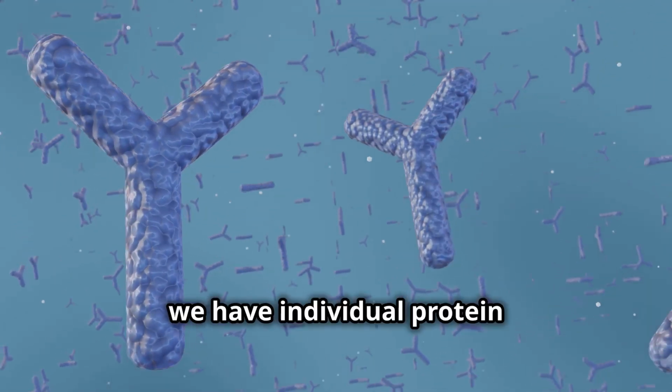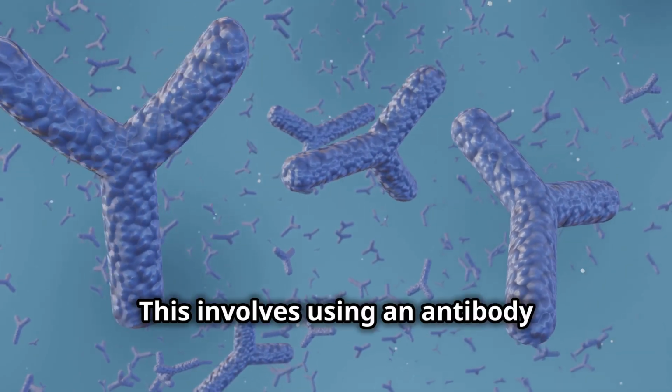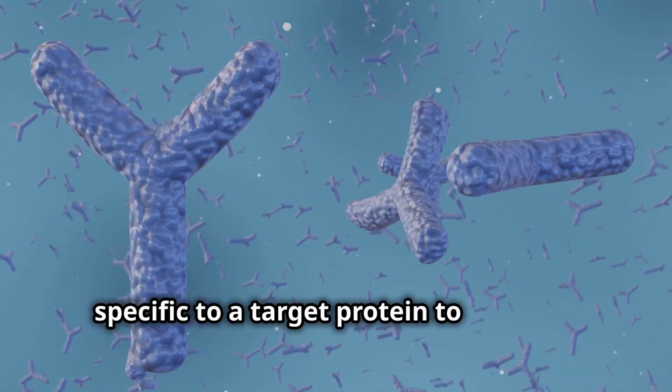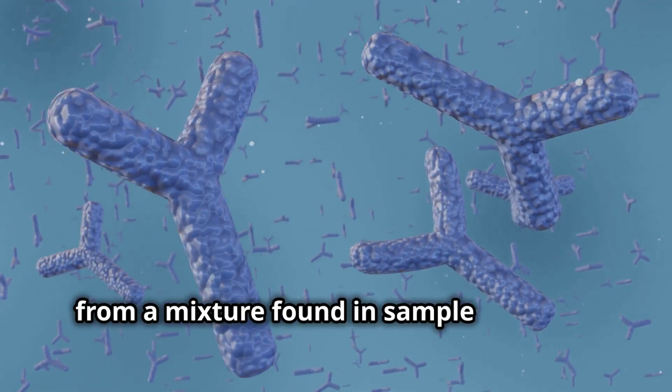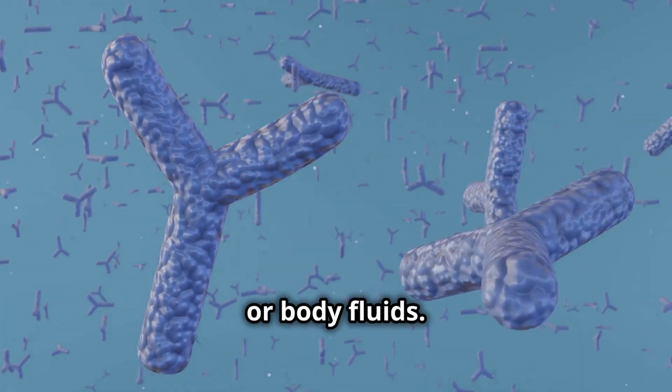First, we have individual protein immunoprecipitation, IP. This involves using an antibody specific to a target protein to isolate it from a mixture found in sample solutions like crude lysates from plants, animals, or body fluids.